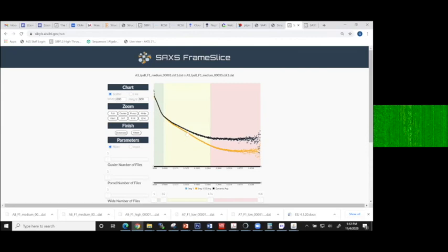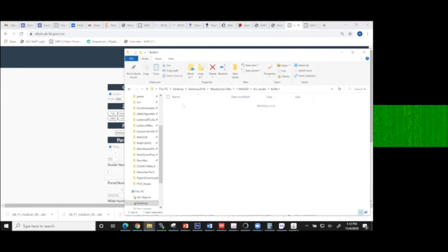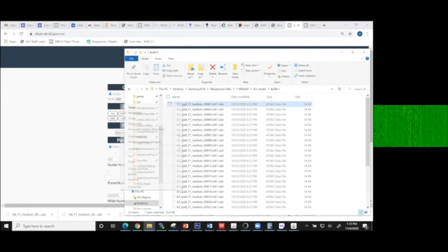So this is a case where that first file is bad. You'll see as I increase the number of frames here, it immediately drops down to the height. So that very first frame, I'd want to remove that one. Yeah, and I would go into the folder and delete it. Let me do that, actually. Sorry, Mikkel. It will be more than 2 minutes. It'll be like 5.